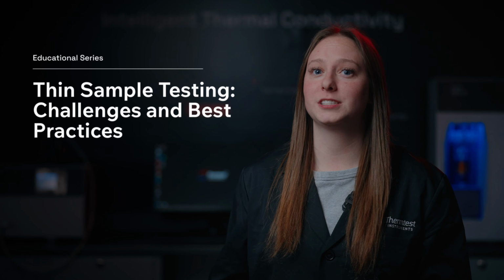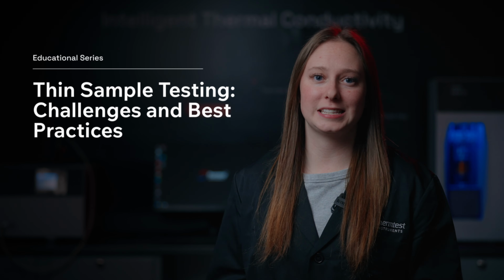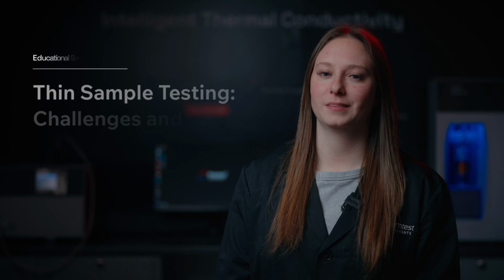Thin materials are some of the most challenging samples to test accurately for thermal properties. Unlike bulk materials, thin samples are flexible, fragile, and extremely sensitive to setup errors. Even small issues like surface roughness or inconsistent pressure can have an outsized impact on your results. Methods that work well for thick, rigid samples often fail when applied to thin films, producing results that might look repeatable but aren't actually representative.